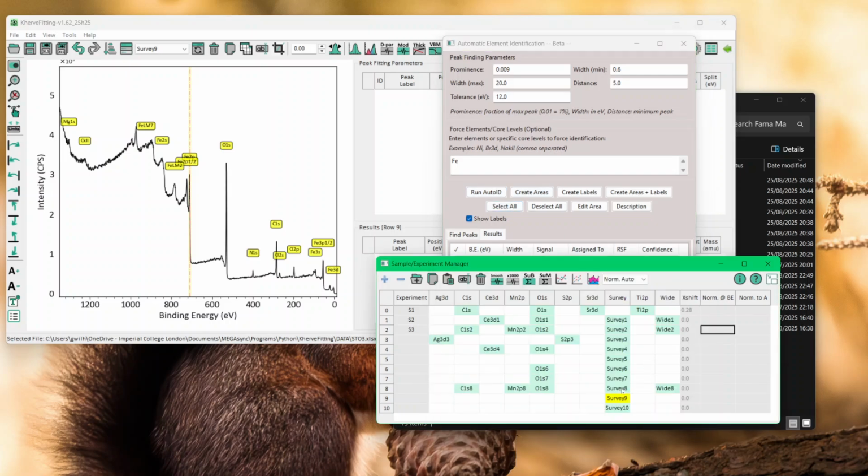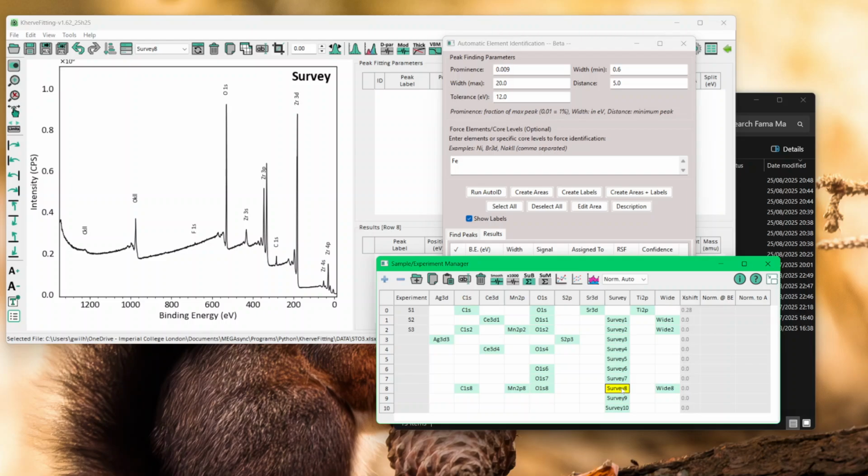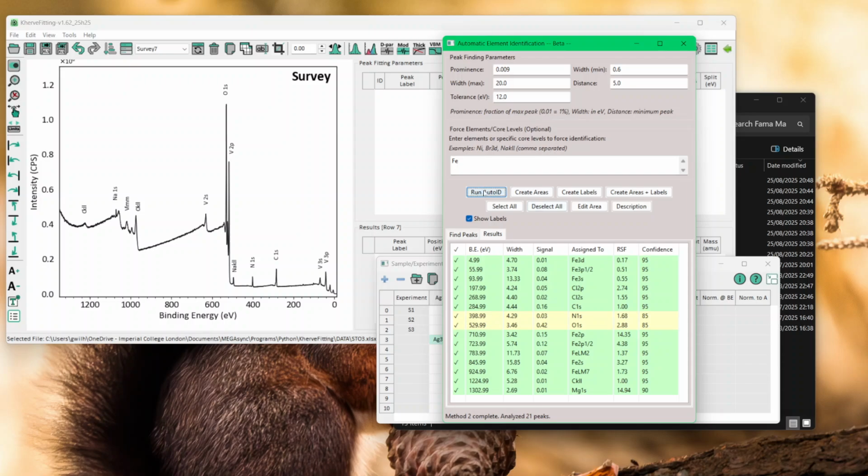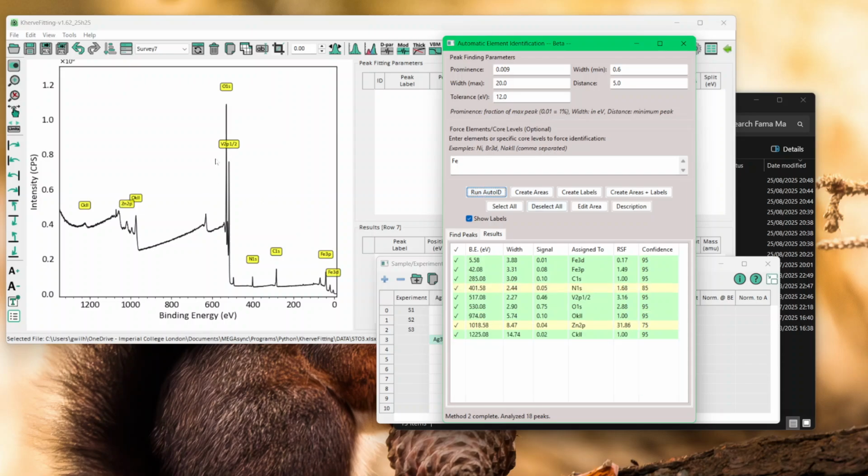If I now look at others, let's say something like this is the zirconium, which I want to show later. This is vanadium. So let's say vanadium will fail. If I run this, it will find, okay, it finds also vanadium, but it's not great. And you see, he's thinking that there is zinc and so on. So tell him simply, sorry, I've told him there is iron and there isn't. So let me just ask again. And he found maybe zinc, but it's not.